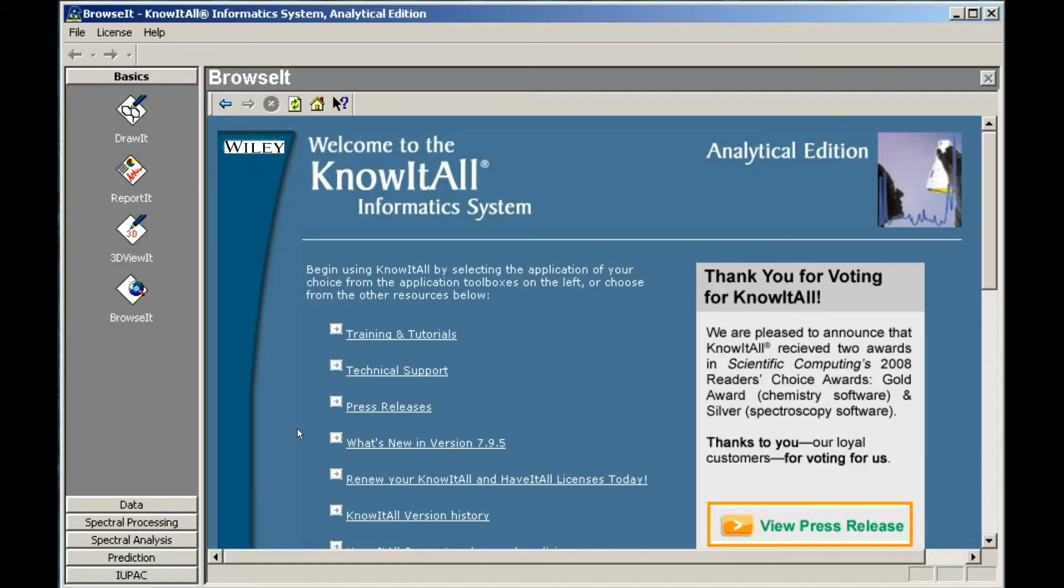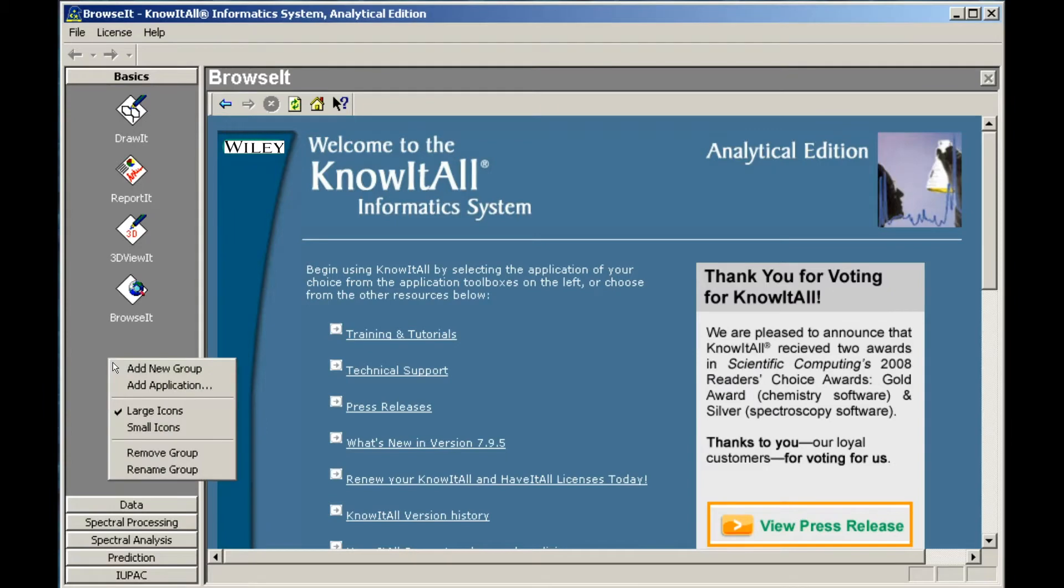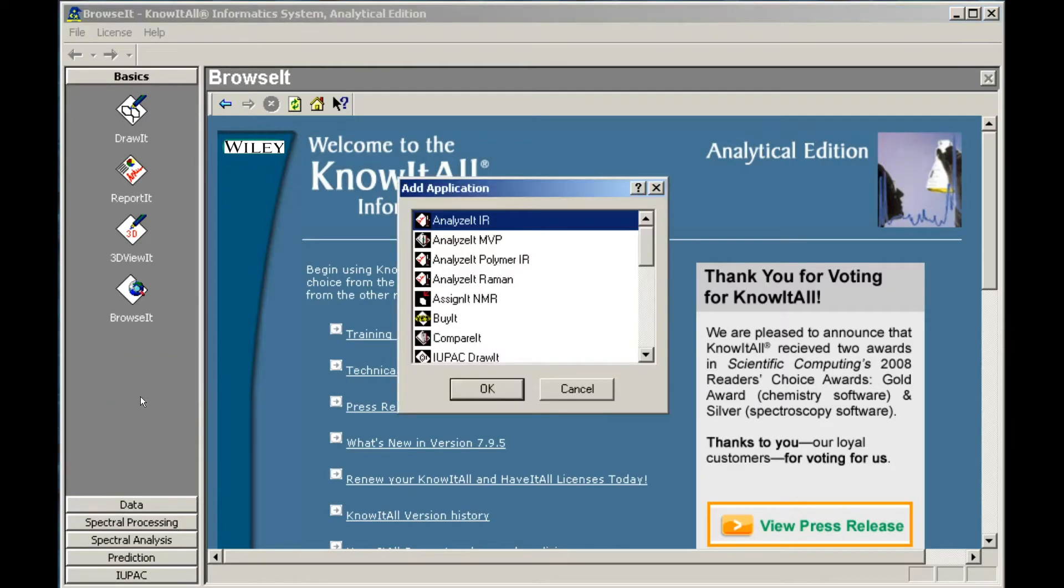We begin by adding an application to an existing toolbox. Right-click anywhere in the Basics toolbox to open a pop-up menu, then choose Add Application. Select the application you wish to add to the Basics toolbox, then click OK.